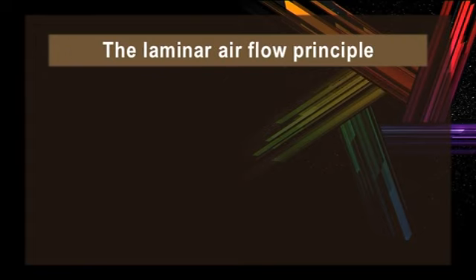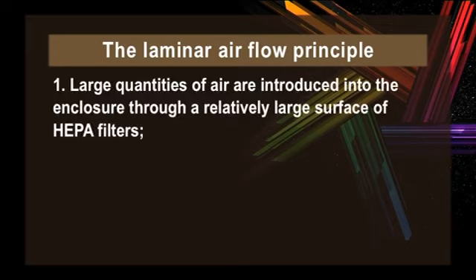Satisfactory application of the laminar airflow principle to produce a clean environment depends upon two rather simple features. One, large quantities of air are introduced into the enclosure through a relatively large surface of HEPA filters.